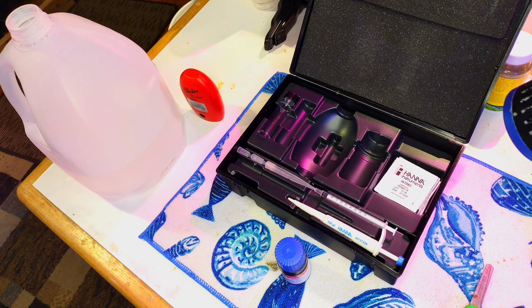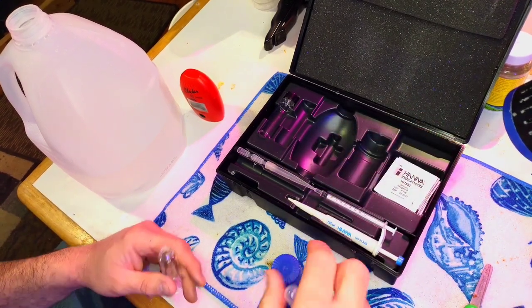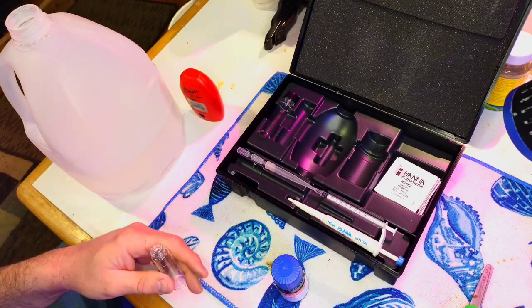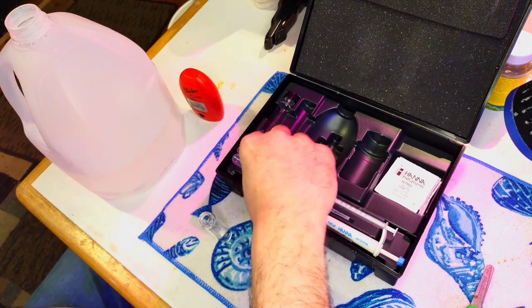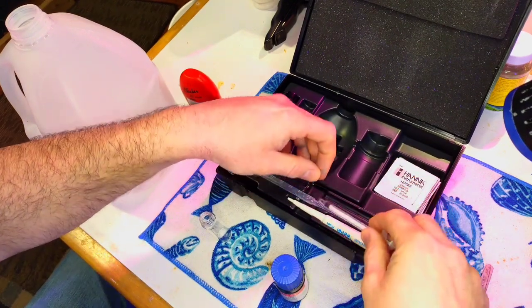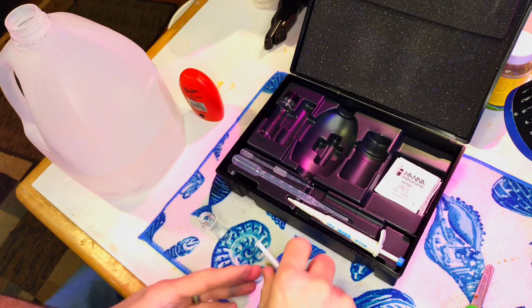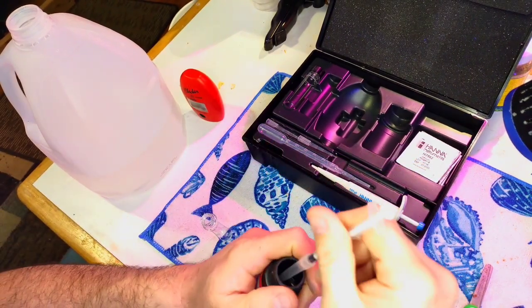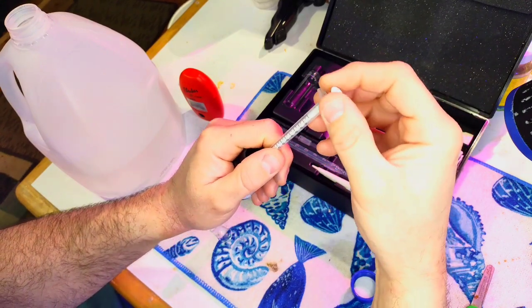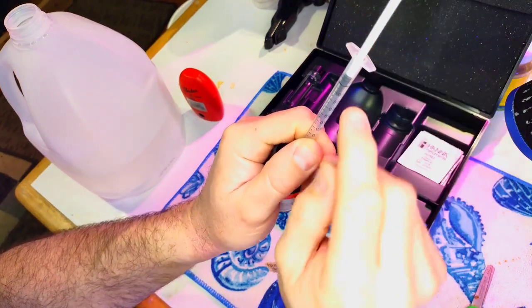On this test you don't get 10 milliliters of tank water — you get one milliliter of reagent and then fill the rest up with distilled water. The actual tank water sample is very small. Set that aside and put in your one milliliter of reagent. Draw it up until the bottom part of the plunger is on the zero mark — here's 0.1, you want it up there. It can be hard to see on camera.